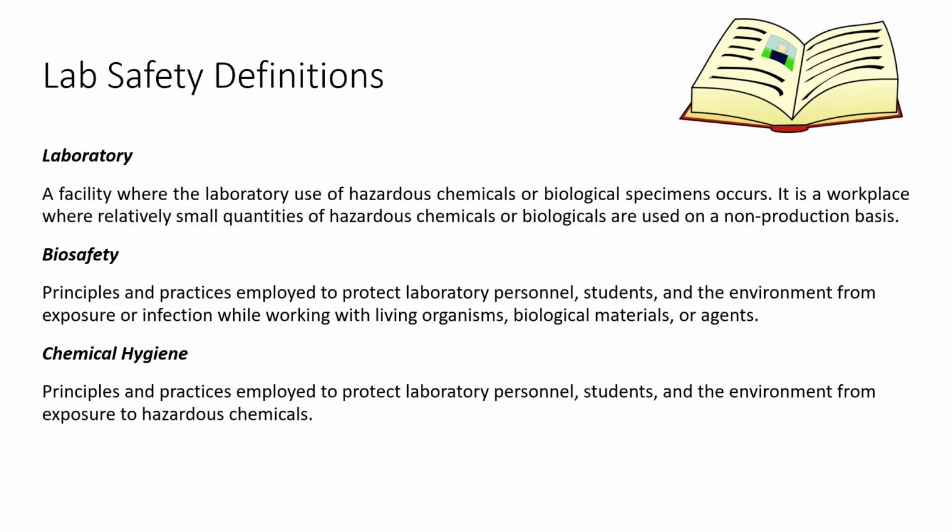The chemical hygiene is another topic. We do use chemicals in clinical chemistry. We add reagents, and sometimes those are done benchtop, sometimes those are done by the analyzers, but if the analyzers go down, then we end up reverting to using the benchtop addition of chemicals. Chemicals and reagents also have to be replaced on those large clinical chemistry analyzers, so that's another potential source of exposure.